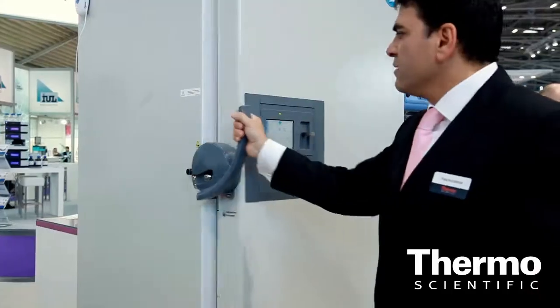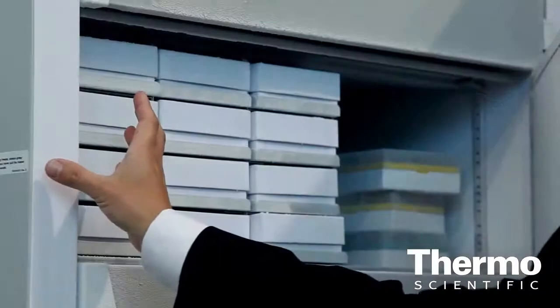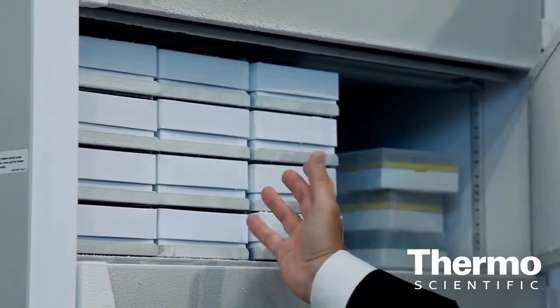Biobanking is a really complex and really important thing for drug discovery, holding markers and storage. Samples can be stored for an infinite time, and it's important that they're stored at the precise temperature. If they're outside of those parameters, the viability will be very, very low. So we've designed our instruments purely around sample integrity, ensuring that from the top to the bottom of the cabinet there is a harmonized temperature to the scientific specification.